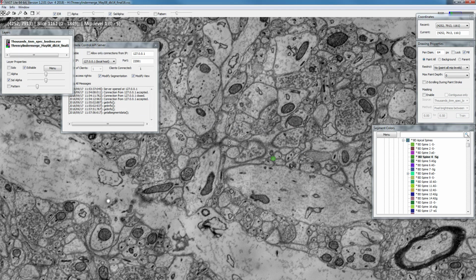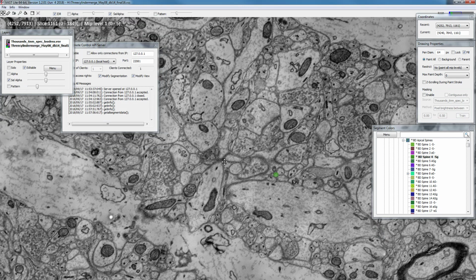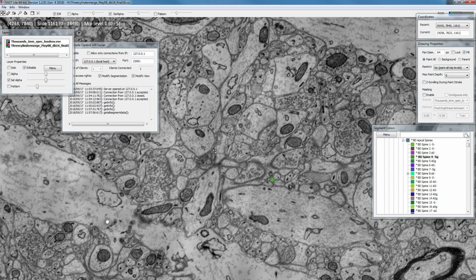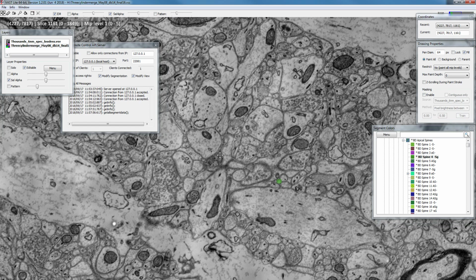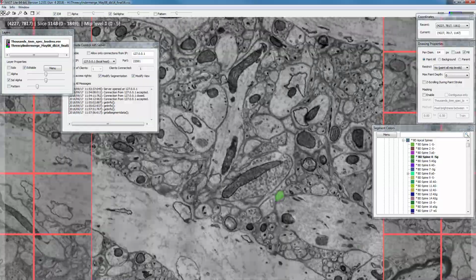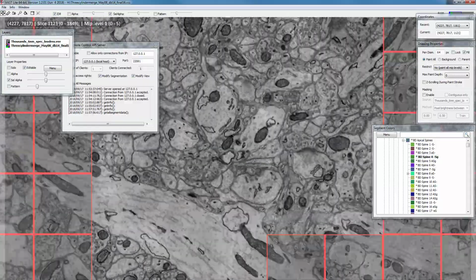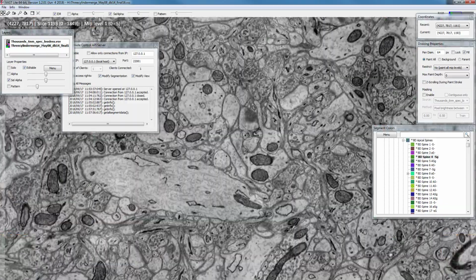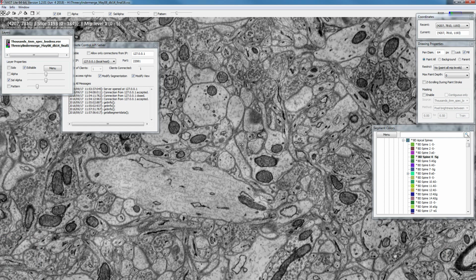Okay. And you'll see now the center cross here. So that defines the coordinates that are being shown in the coordinates window. And it also can be read by VAST tools and be used to define a corner of a region to be exported. So keep in mind that this is actually three-dimensional, and if you want to set the minimal and maximal slice, you have to also place corners in the minimal and maximal extent in Z.